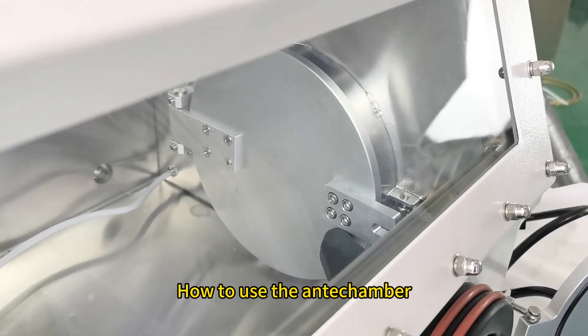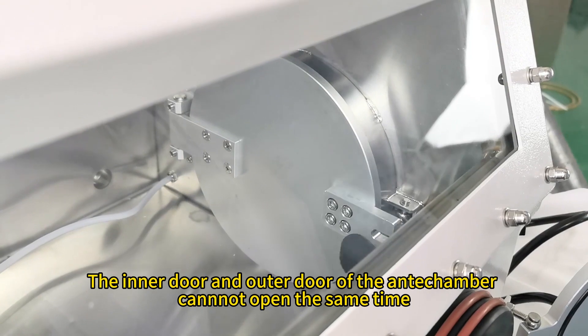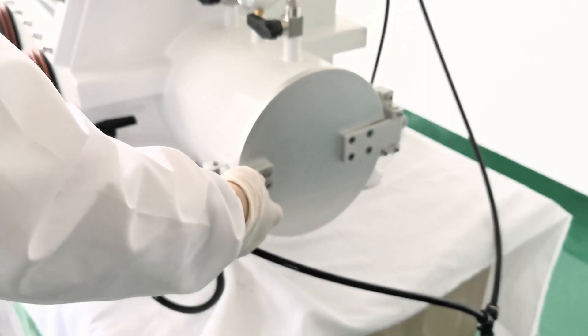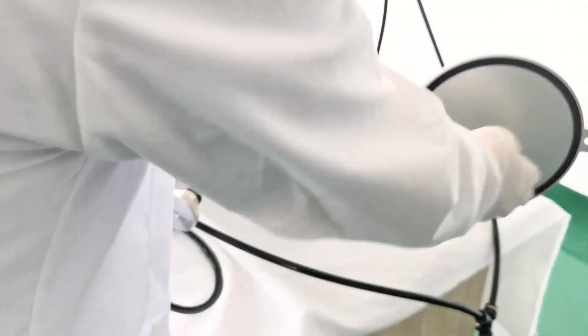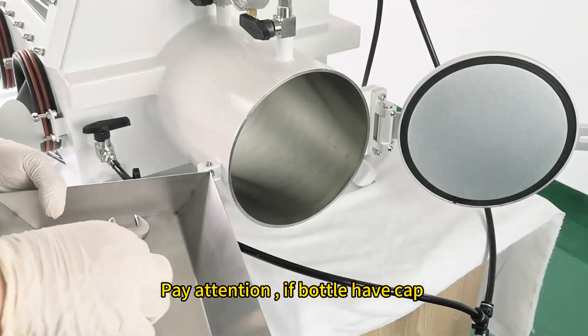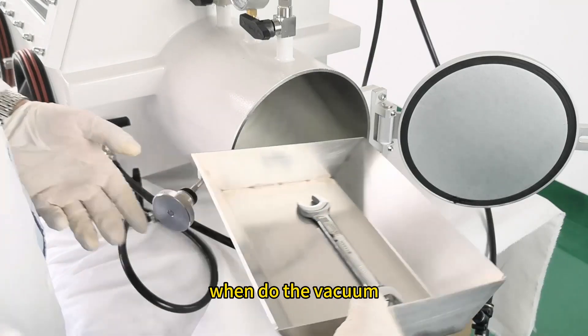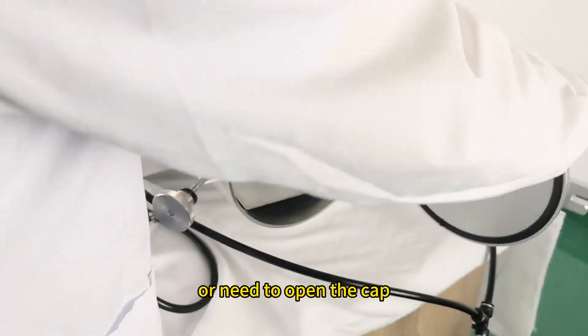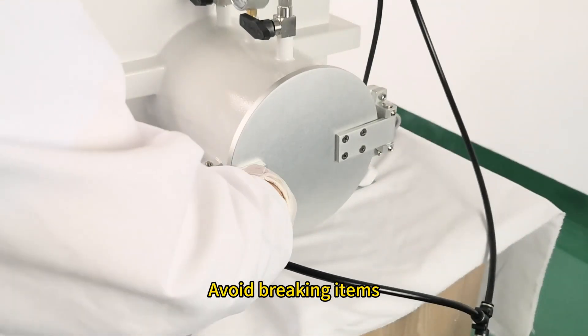How to use the antechamber? The inner door and outer door of the antechamber cannot be opened at the same time. Put the item in — pay attention: if a bottle has a cap, when doing the vacuum, do not vacuum too much, or you need to open the cap to avoid breaking items.